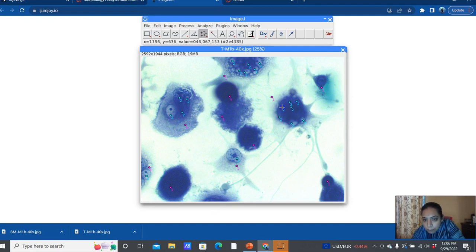I think I got most of these nuclei. There's some in here that I can see, and I know on your screen it may not be very visible, but there are 3 that I can see very well inside. There's one here, there are 2 here. So that would be my second count. This is the number of nuclei that are present.